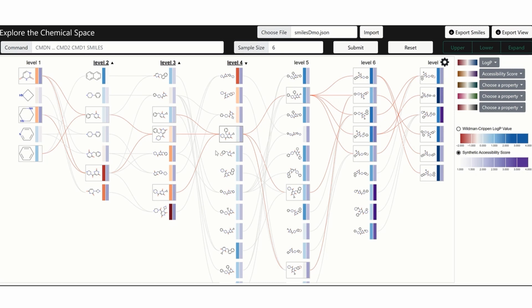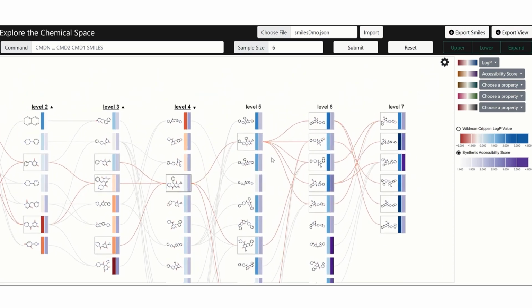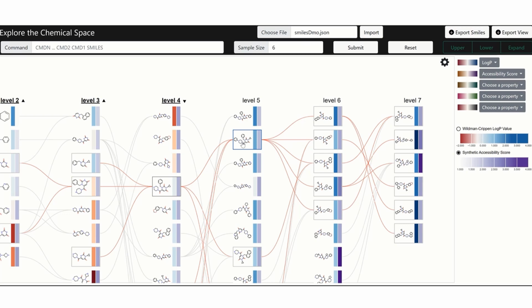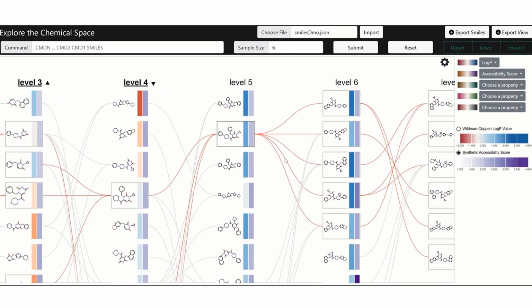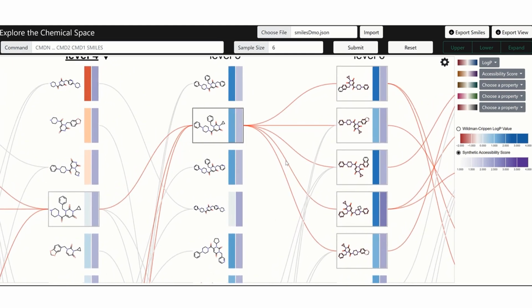Zoom interaction is used to identify selected scaffold as substructure in the higher levels. In all the upper levels of selected scaffold, if the selected scaffold is present, zoom operation highlights the structure of the selected scaffold using a red color stroke.